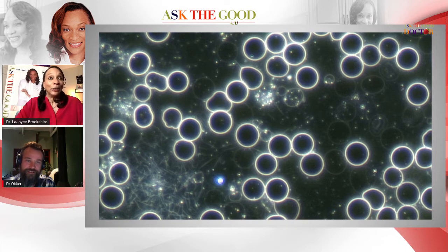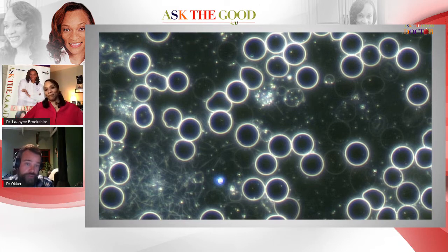Can you explain that? It's really just related to what I mentioned earlier, the zeta potential. It's that negative charge on the surface of the red blood cell. As the system becomes more and more toxic, and the system's not able to eliminate, these things accumulate, and the effect on the zeta potential becomes much more pronounced. So the more toxic, the more clumping we tend to see, and in those cases, because there's so much room for improvement, giving them some ionic minerals and other substances that will help to restore that zeta potential has a dramatic impact on what you actually see in the sample.